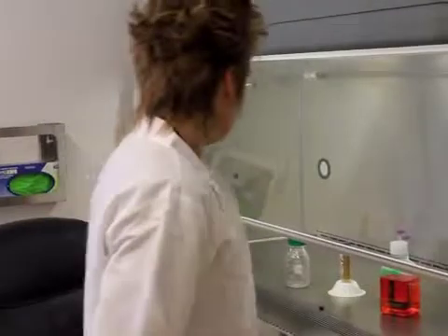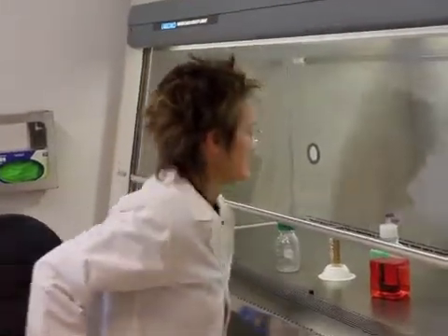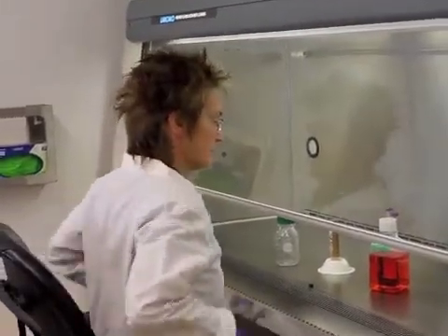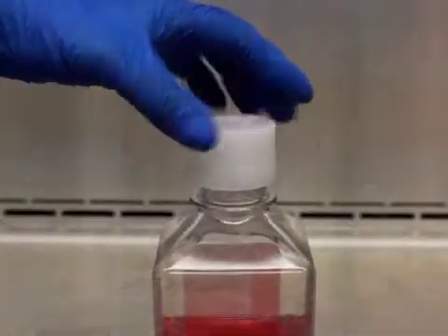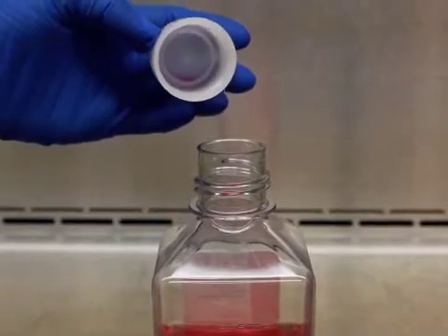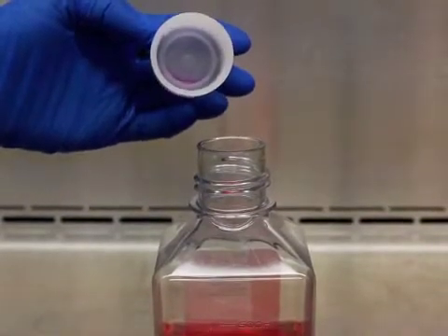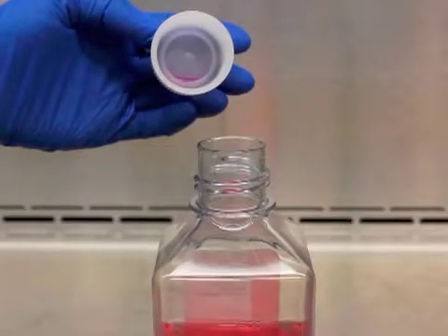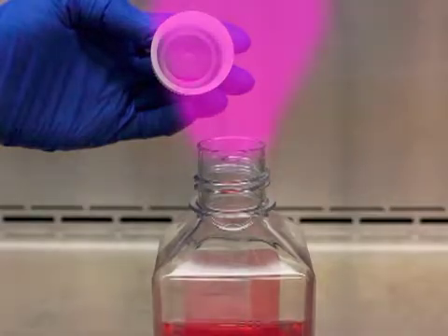As you begin working with cultured cells, there are several key aspects of aseptic technique that are important to keep in mind. Whenever a bottle or tube or flask or dish is open, the interior and contents are vulnerable to contamination. It's particularly important to be aware of the zone directly above any vessel. Any contaminants within this region could fall into the vessel and contaminate the contents.